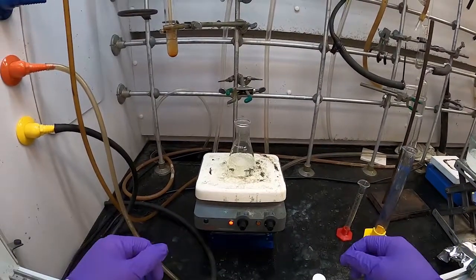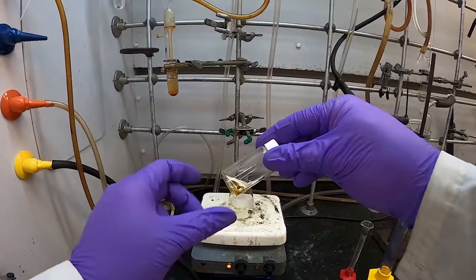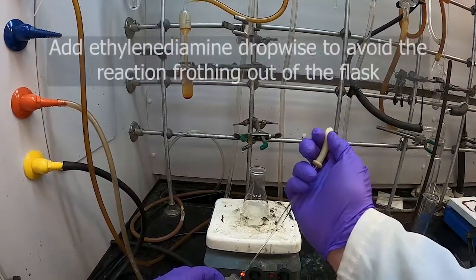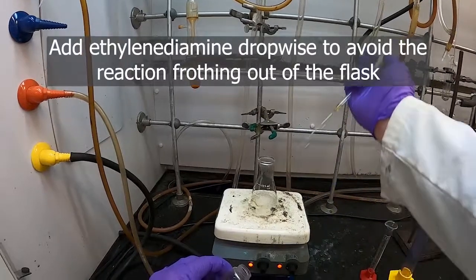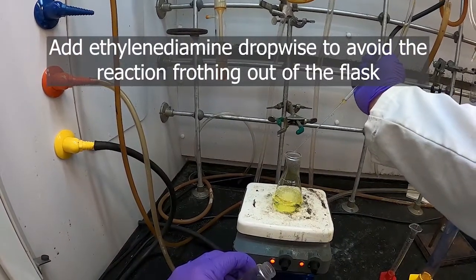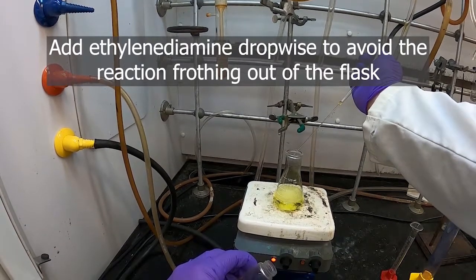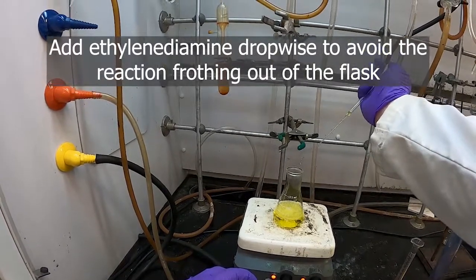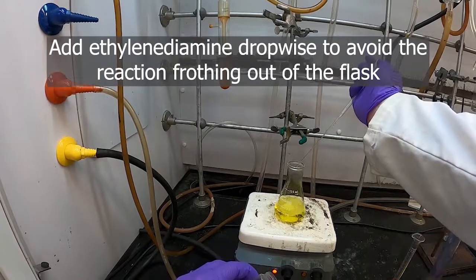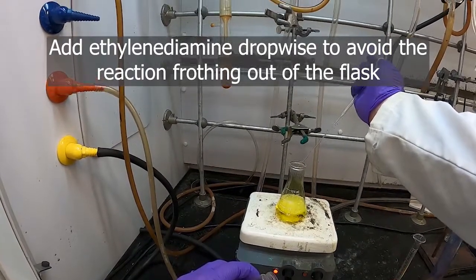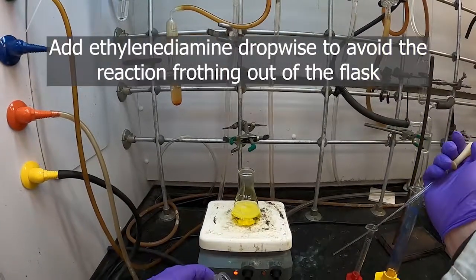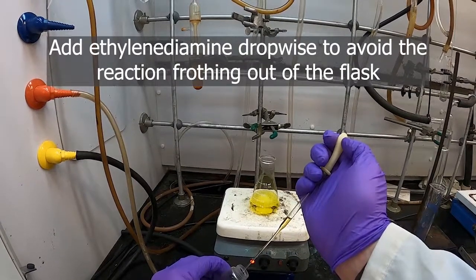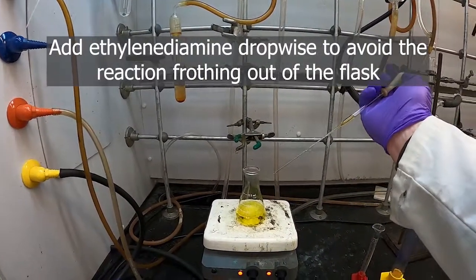So our ethanol has reached a boil, so now we're going to add our one gram of ethylene diamine here, very slowly so that we don't have it foam over. Nice yellow color.